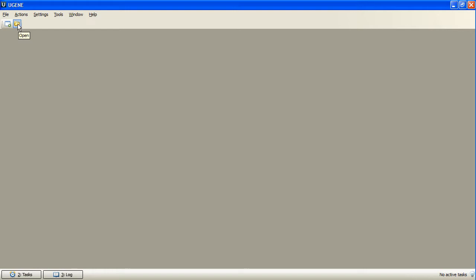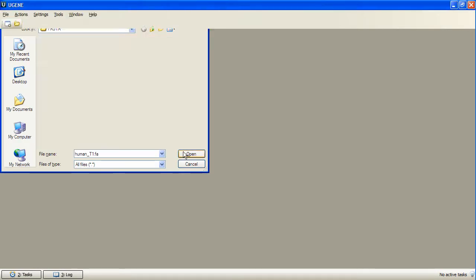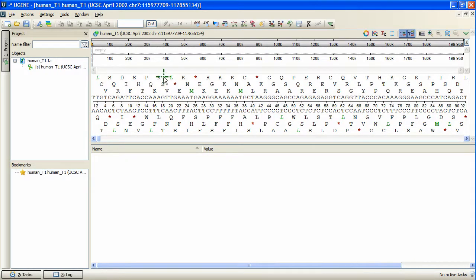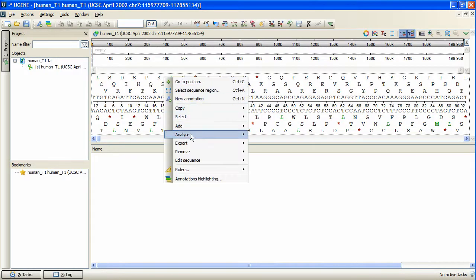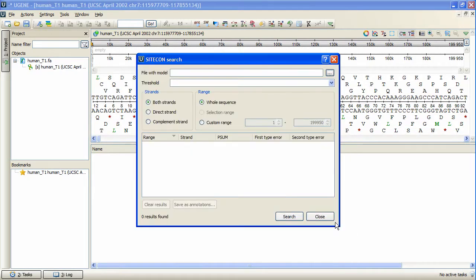To show how to search for TFBS of a DNA sequence, I will open a nucleotide sequence. The next step is to invoke the plugin. Right-click at the opened view and select Analyze – Search TFBS with SITECON. The opened dialog box contains file with model field.